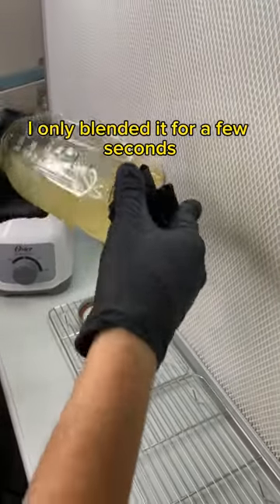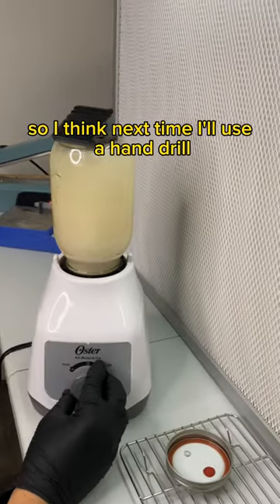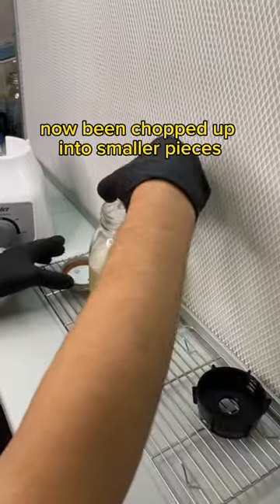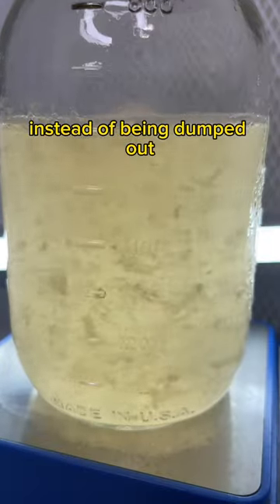I only blended it for a few seconds but it seemed to work almost too well, so I think next time I'll use a hand drill to spin the blade. The thick mycelium has now been chopped up into smaller pieces which can be made into syringes instead of being dumped out.